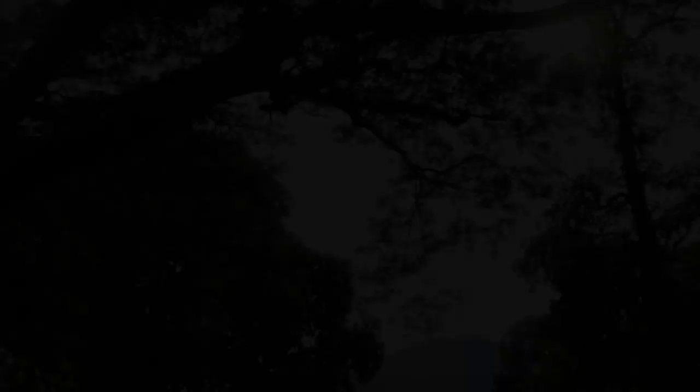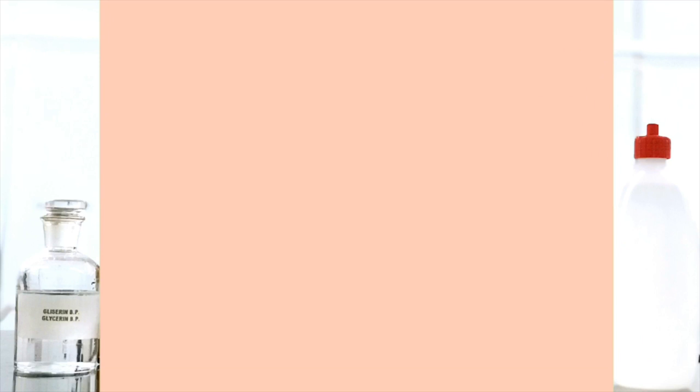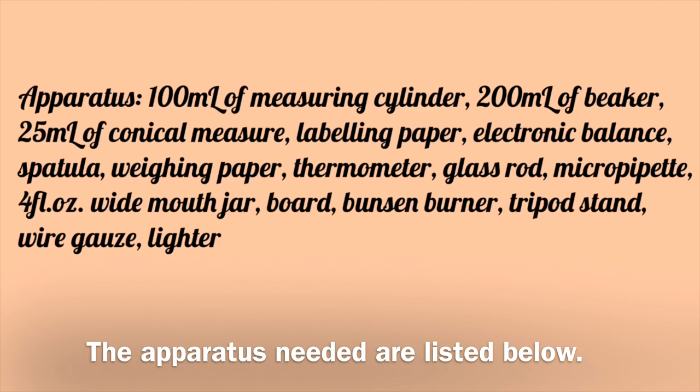Today, we are going to prepare Ephedrine Sulfate Jelly! The apparatus needed are listed below. Here we go!